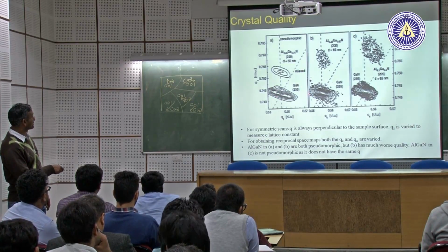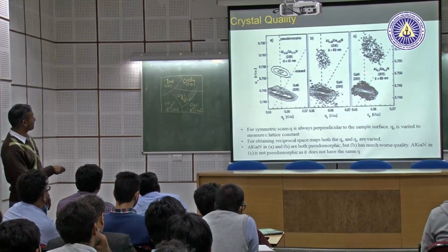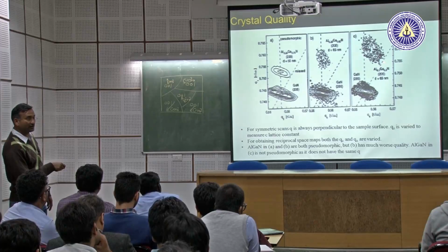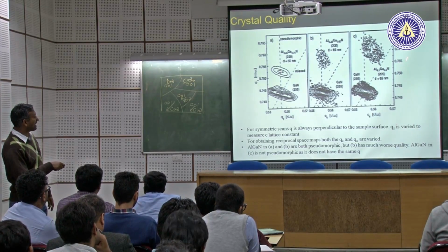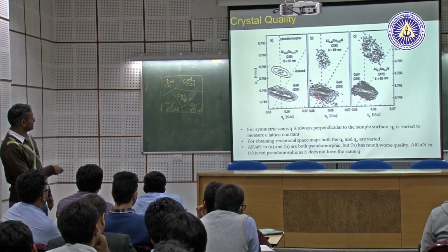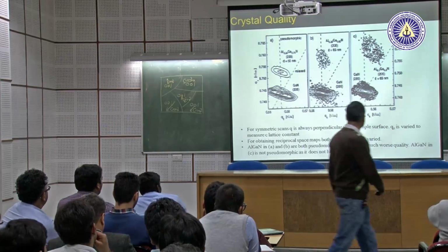Okay? So you can see that as you increase the thickness of the film from 50 to 65 to some other composition here, this spot gradually starts moving to the relaxed line. What it tells you is that the thin films are getting more and more relaxed as you change the thickness or composition. And by measuring the D spacing precisely, you can calculate the strain values and any composition effect.